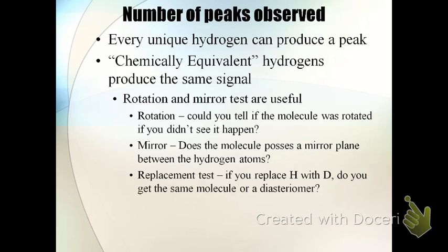And then finally, we'll put it all together with a worksheet in class where you do just hydrocarbon NMR and try to determine what the structures are based on empirical formulas and the NMR signals.